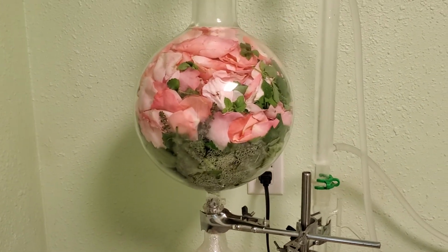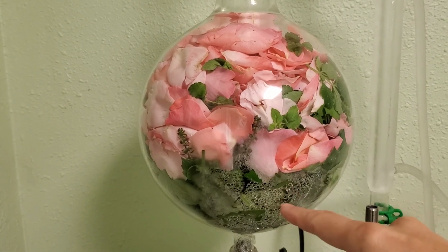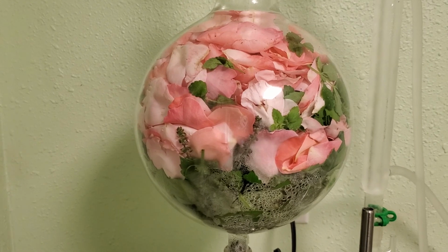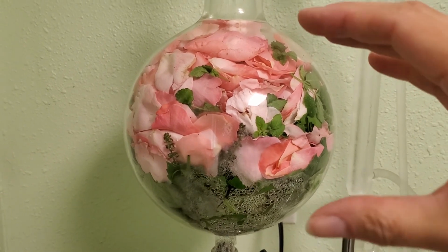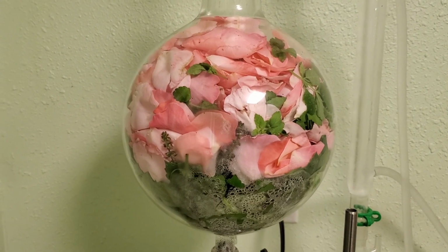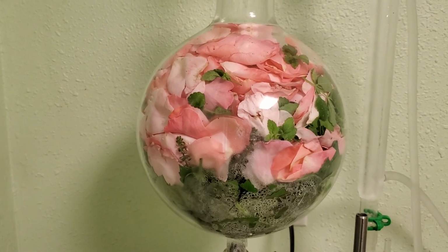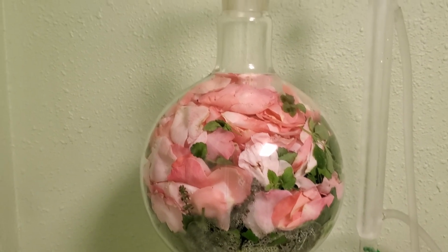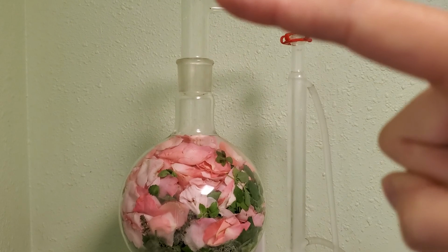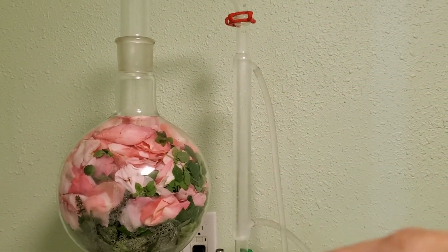So there's our fresh herbs. You can start to see some water that's condensing here, and there is steam moving its way up through here. As we let this distillation continue, your plant material will probably shrink by at least half, as a lot of the nice water-based constituents or parts of the plants actually get picked up and into the steam. And so then the steam will move its way up through here, make a turn, and then go down here into the condensing unit.